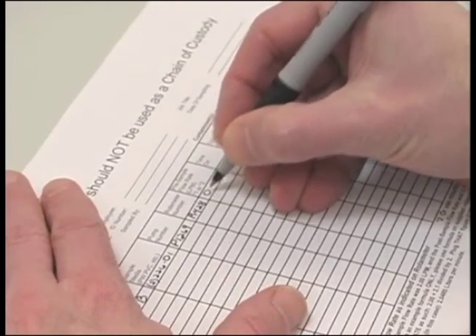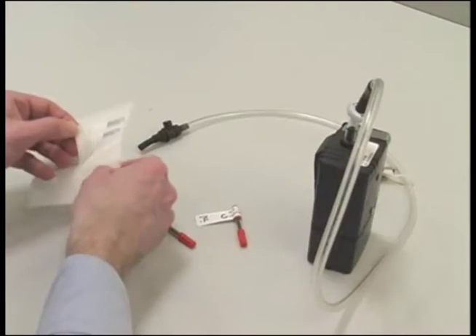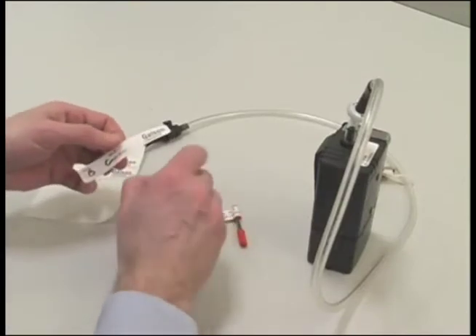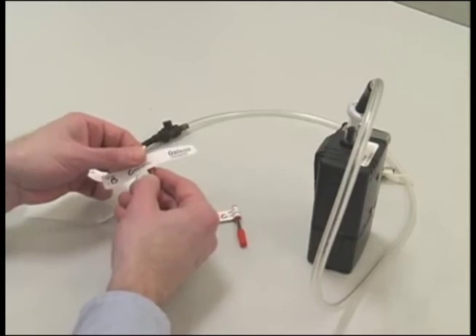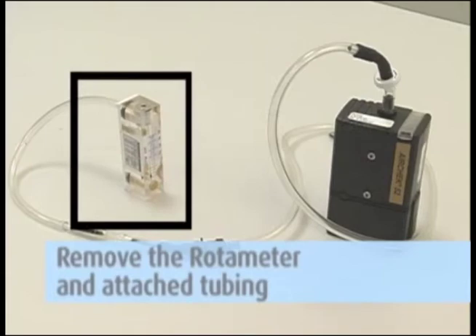After you are satisfied with the flow rate, record the value on the field pump data sheet. Remove the sorbent tubes, cap their ends, and mark them as front and back for use in the post calibration you will be performing after testing is completed. Remove the rotometer and attached tubing.